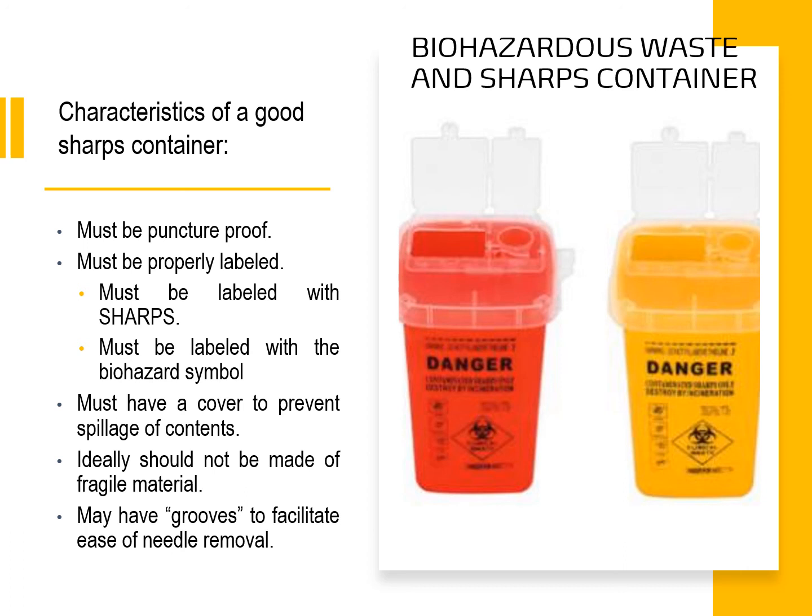Because in some hospitals, they manually remove the needle from the barrel by using the forceps. But it's because their sharps container cannot provide a groove for them to insert their sharps and twist the barrel so that the needle will just fall off inside the container.